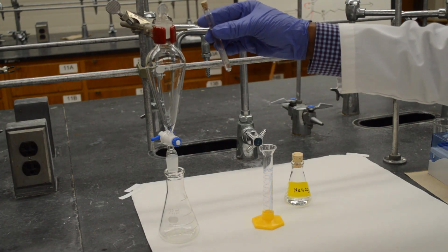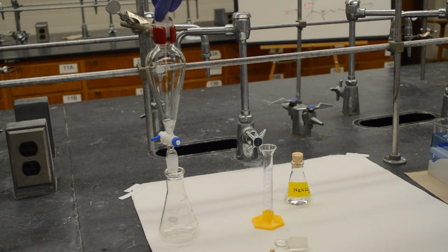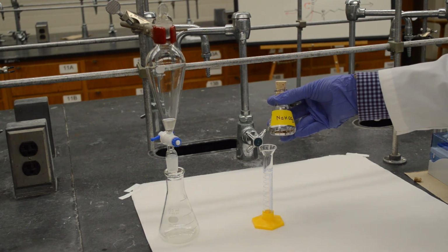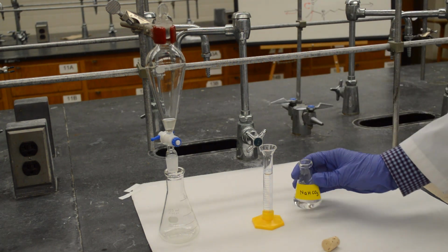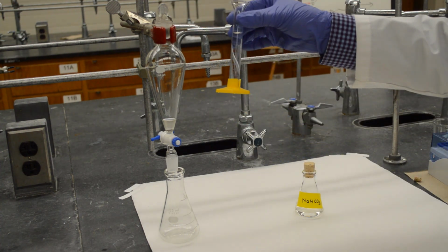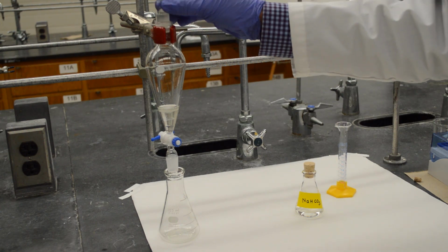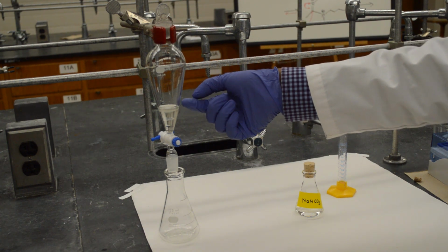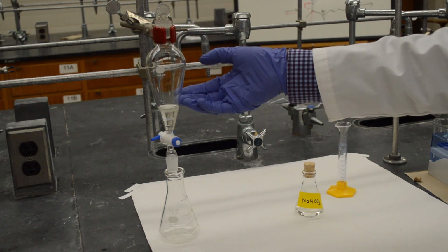Add your intermediate into the separating flask. Now add 10 ml of 5% sodium bicarbonate. Okay, that's 10 ml of sodium bicarbonate. Here's the aqueous phase, and the top one is the organic phase. I'm going to mix the two liquids so the base will remove the protons from your intermediate.